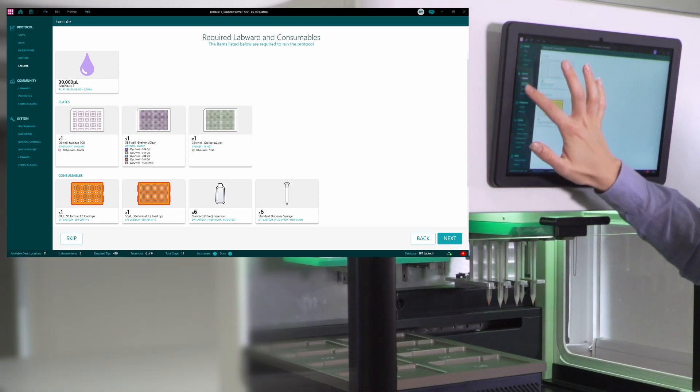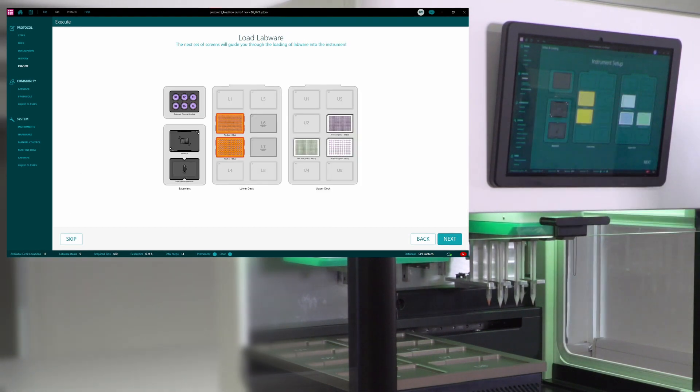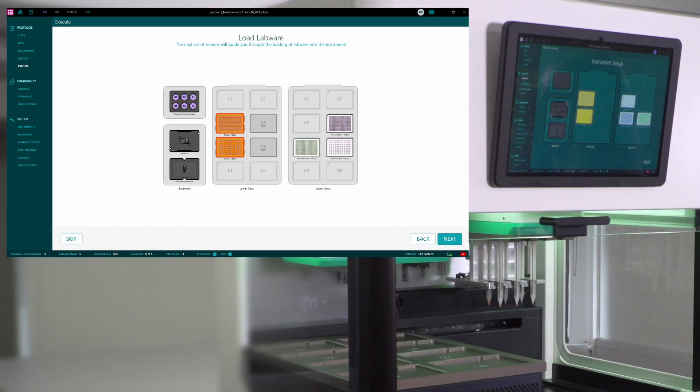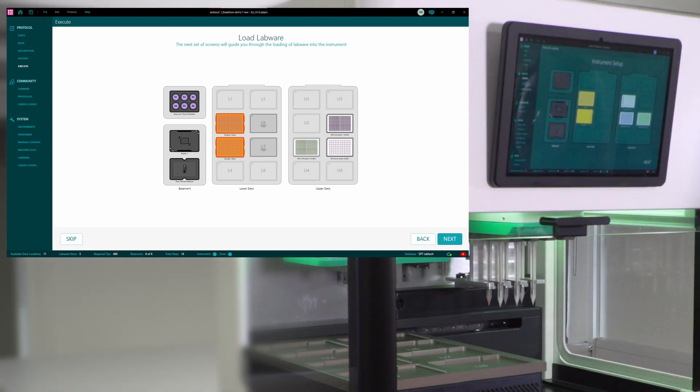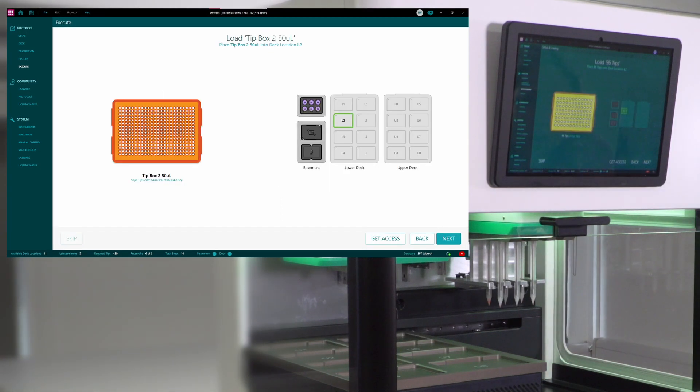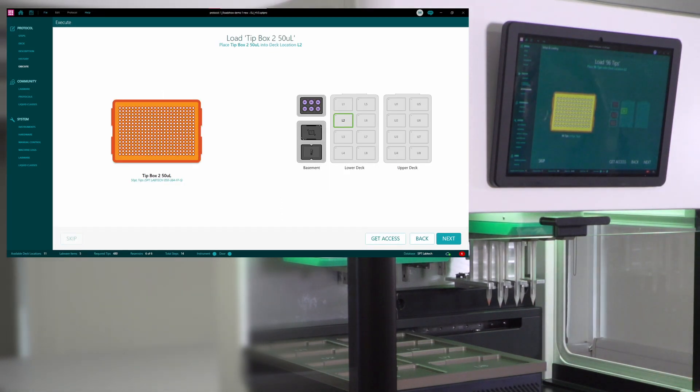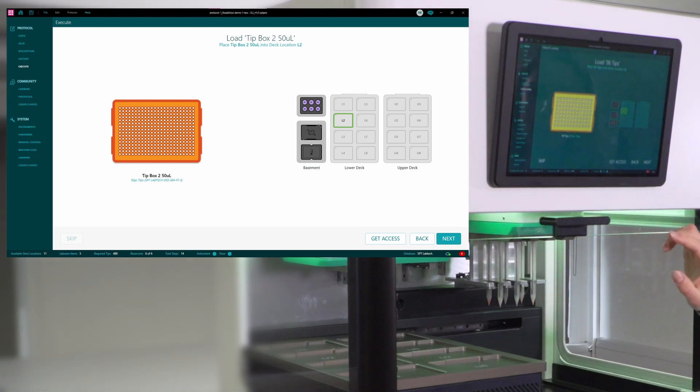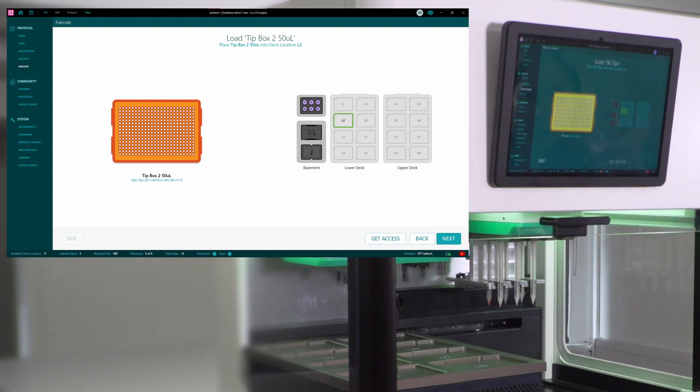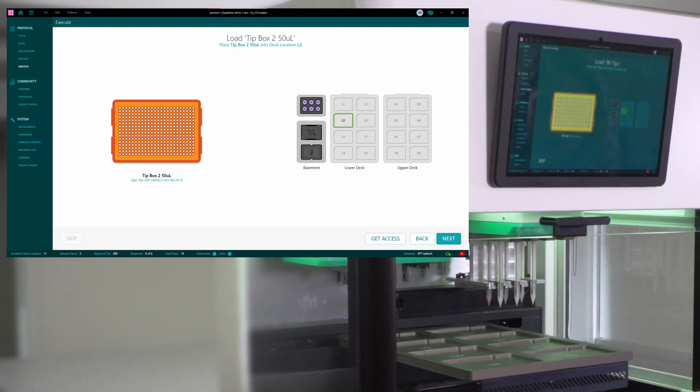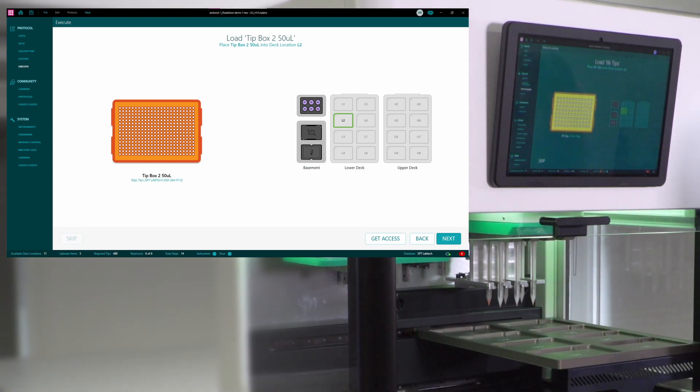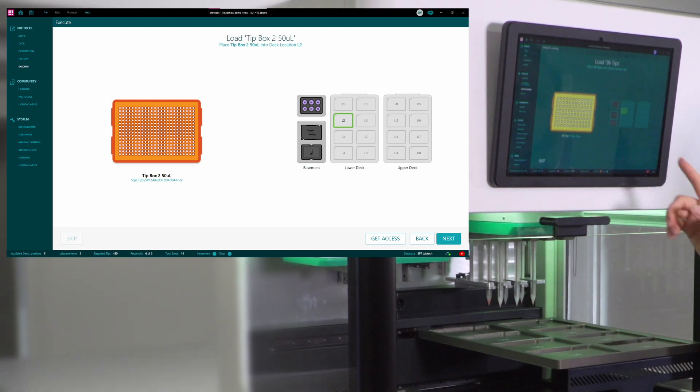So now I can start doing the setup and loading, and here is the overview of what my instrument deck would look like after I've finished setup. And now I'll just go step by step, moving all the things in the right places. So first of all, I would load the tips, and to do that, I can press get access, and the instrument will present itself in the most efficient way for me to start loading.